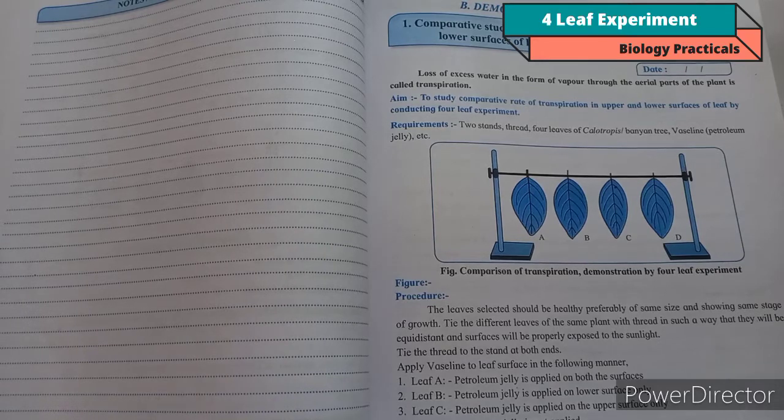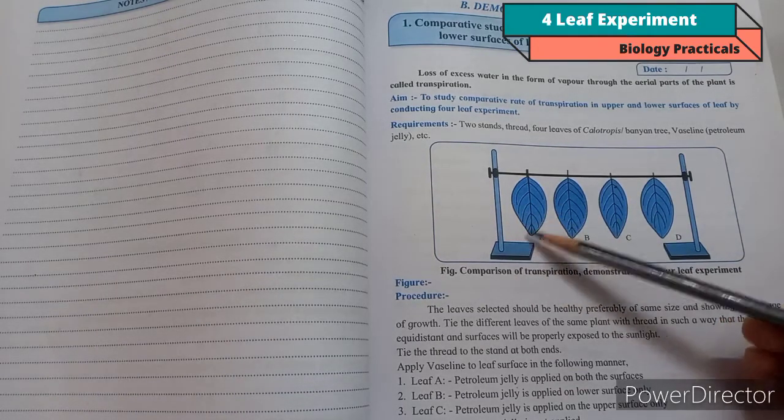Transpiration is an important physiological phenomenon found in plants where they lose water in the form of water vapors through their aerial parts into the atmosphere. Around 98 to 99% of water is lost through transpiration, and 0.2% is used in photosynthesis and the remaining is retained in plants during growth. So what is stomata?